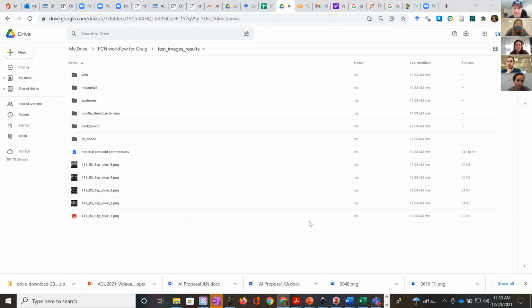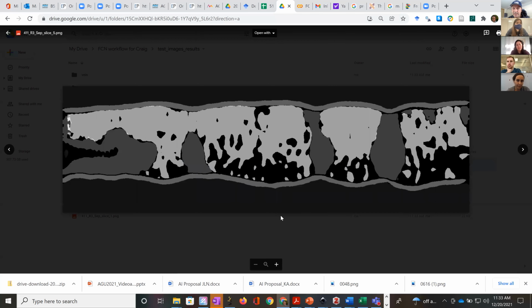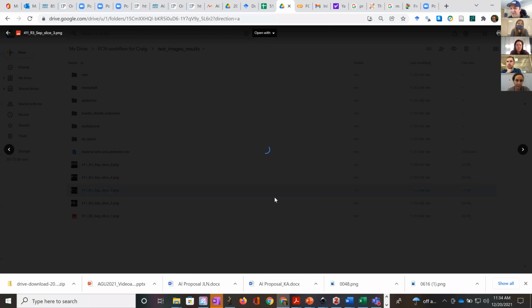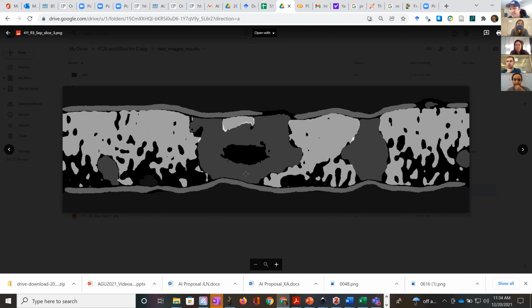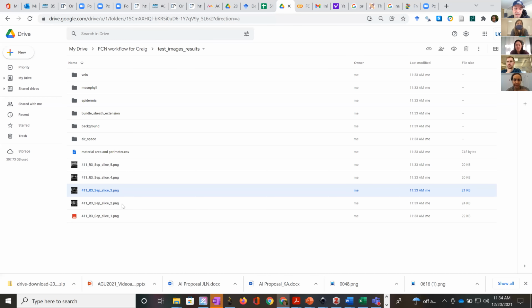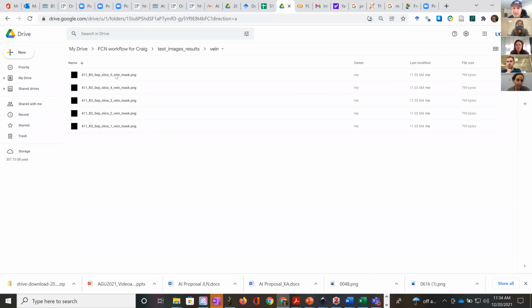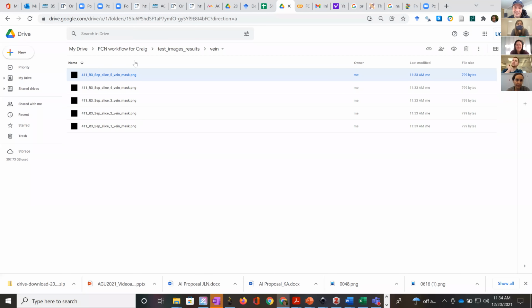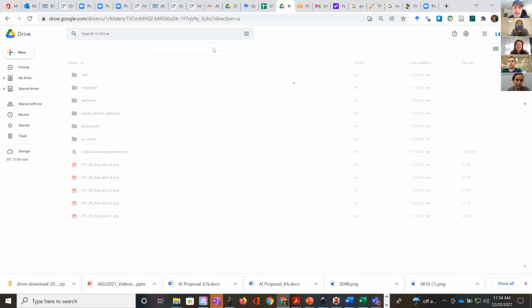And we can see these are the predictions that got made. They're not great, but it is what it is. We didn't train for very long. And so you can see that it's missing the veins. It didn't make any vein predictions. Oh, of course, sorry. I clicked on vein, there's no predictions.